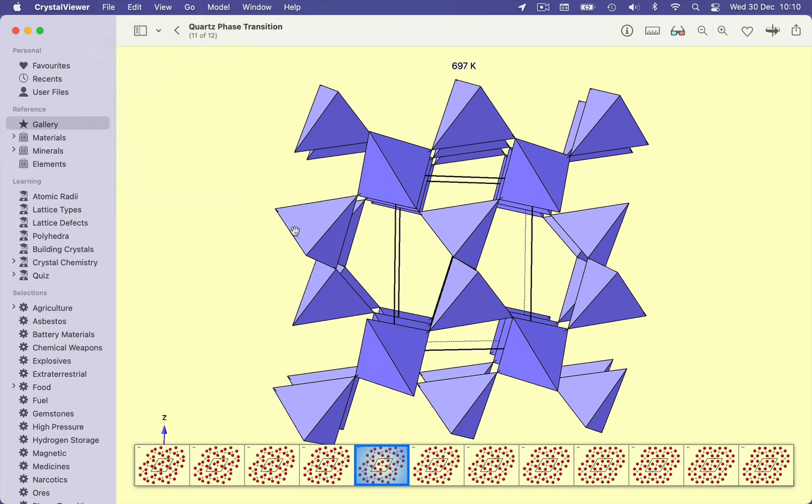So that was a quick tour of the viewer showing how to rotate, zoom, navigate, animate and output structures and graphics.